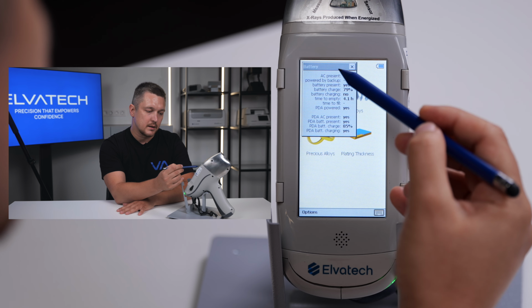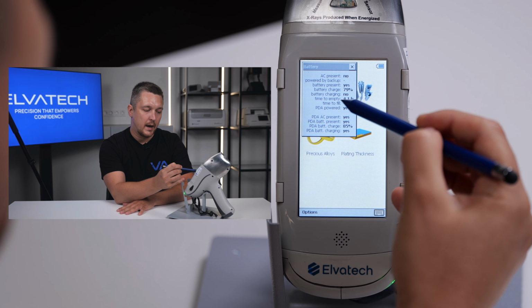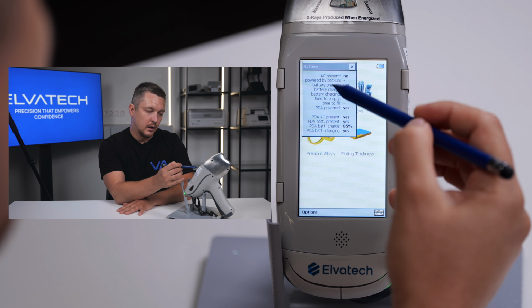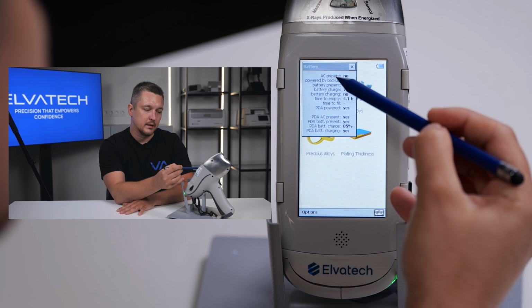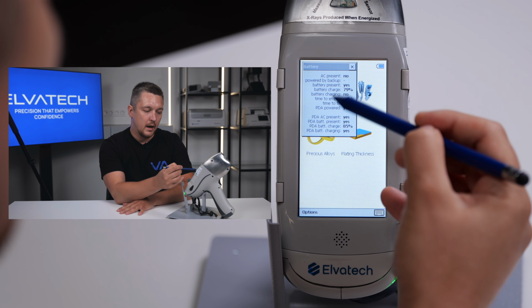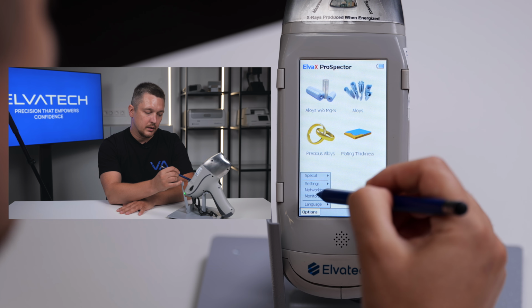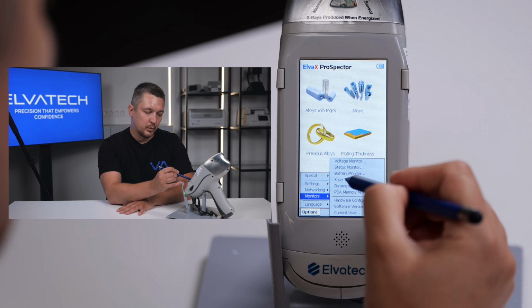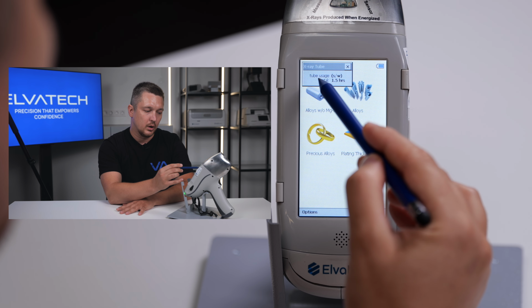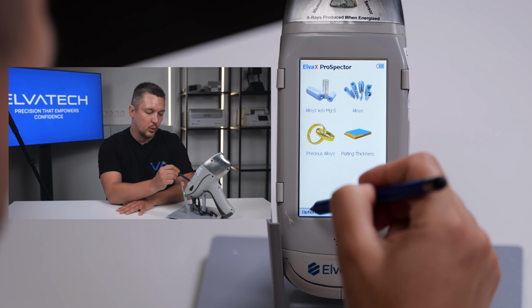Here you see the status of the battery, like battery charge 79%, time to empty 4 hours, and also AC adapter present, which is not connected, and many other statuses. And if you click, for example, on X-ray tube, you can see that the total usage of this X-ray tube is 1.5 hours, and so on.